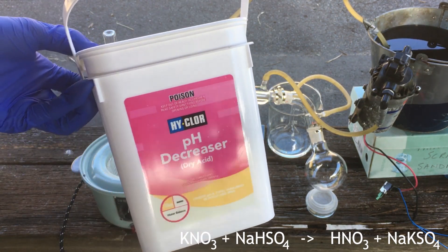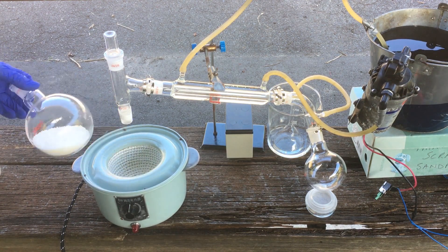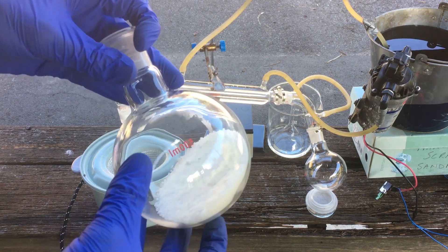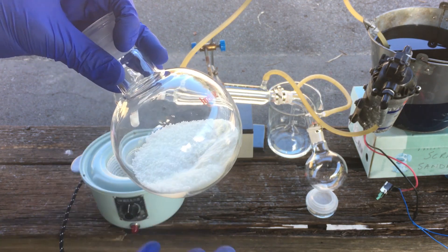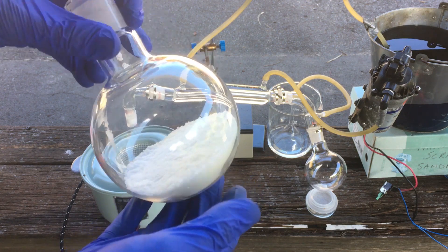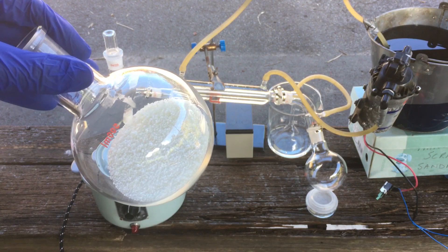I can just buy this easily from the hardware store. What I've got here — all I've done is mix around 35 grams of potassium nitrate with 1.5 molar equivalents of sodium bisulfate. That's quite an excess. Having an excess of sodium bisulfate for the reaction ends up giving us a better yield apparently, so that's what we're going with today.